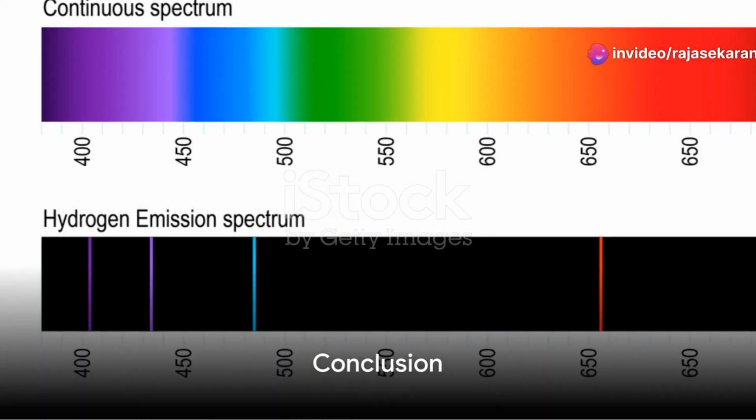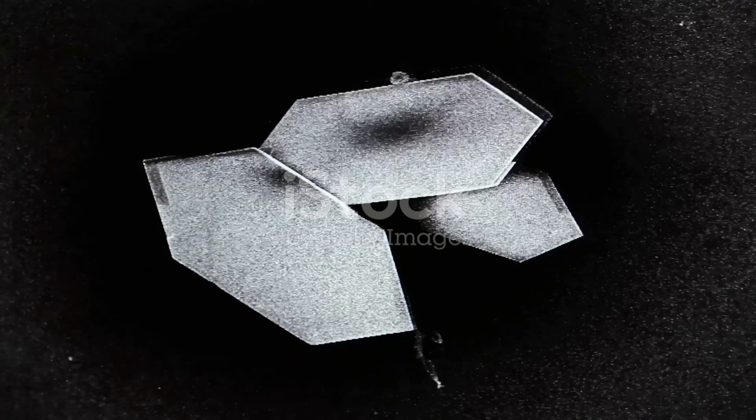To recap, energy dispersive spectroscopy is a technique that uses a beam of electrons to excite atoms in a sample, causing them to emit X-rays. By measuring the energy and intensity of these X-rays, EDS can identify and quantify the elements present in a sample. And when used with scanning electron microscopy, it can also provide spatial information about these elements.